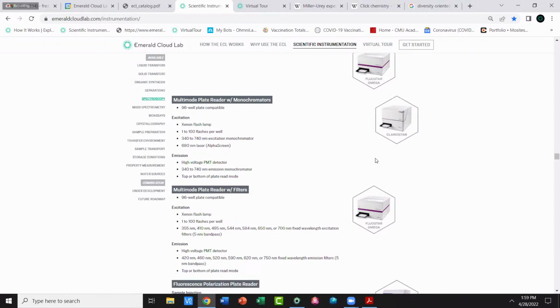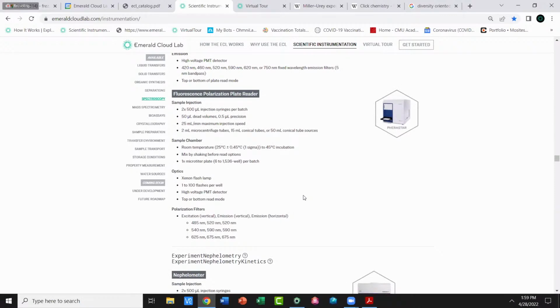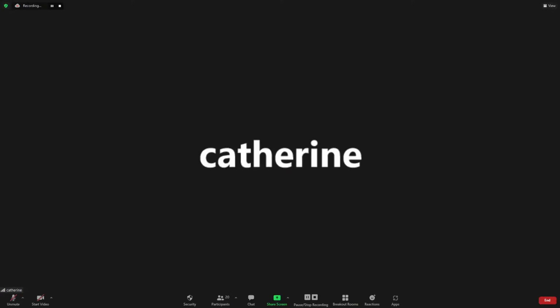As you change species and as you change concentrations and stuff like that, that's really where the heart of the interesting math would come in anyway, to be like, well, how do I model this system? And we'll show you how, if you try to fit, you throw it into an analyze kinetics function. And Catherine, you have an example of that set up, right? Yes, I do. Where when things work nicely, it's beautiful because you can extract rate constants. And when you get these model systems that just break everything, it melts down and nothing fits.